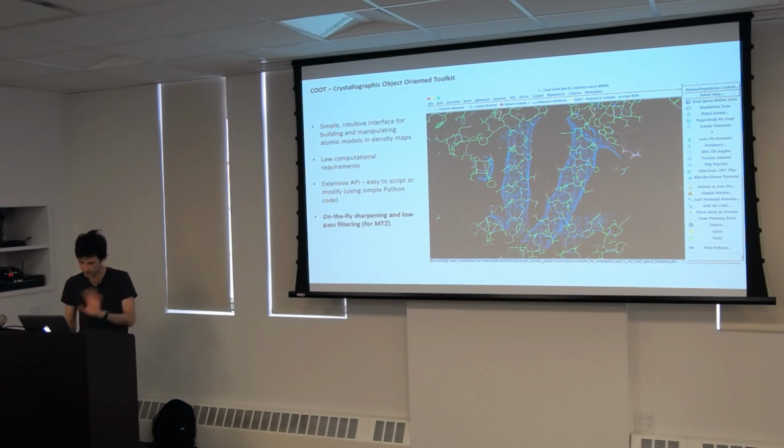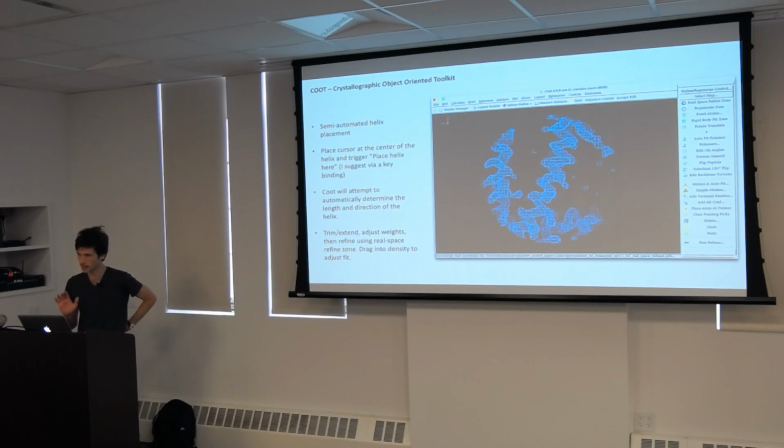All right, but if this is with a model placed here, the way I would start if you were planning to build de novo is to start by placing secondary structural elements, in particular helices. They're the easiest ones to place by far. Beta strands are tricky, and I would deal with those after you've got your helices. Hopefully you've got some helices.